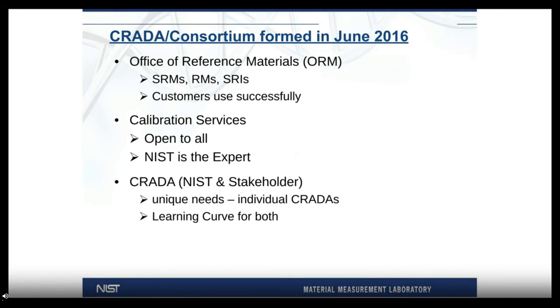We decided to do these ERF value assignments through CRADAs, individual CRADAs with NIST and a particular stakeholder, say an individual bead vendor. And the reason why we decided to do it that way is that the CRADA would enable us to address the unique needs of individual stakeholders, because every stakeholder had slightly different needs.